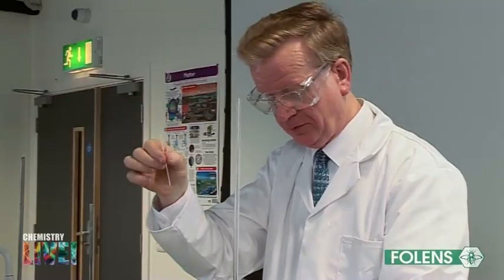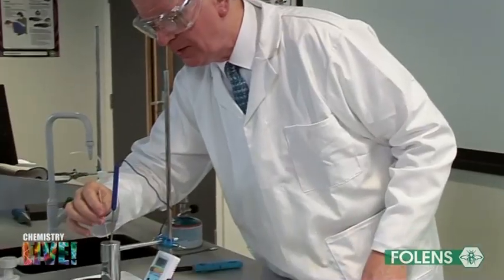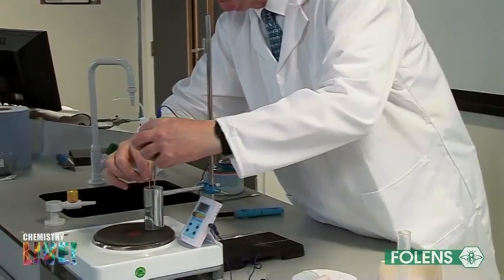Place the capillary tube in the aluminium melting point block on a hot plate and place a digital thermometer in the aluminium block.